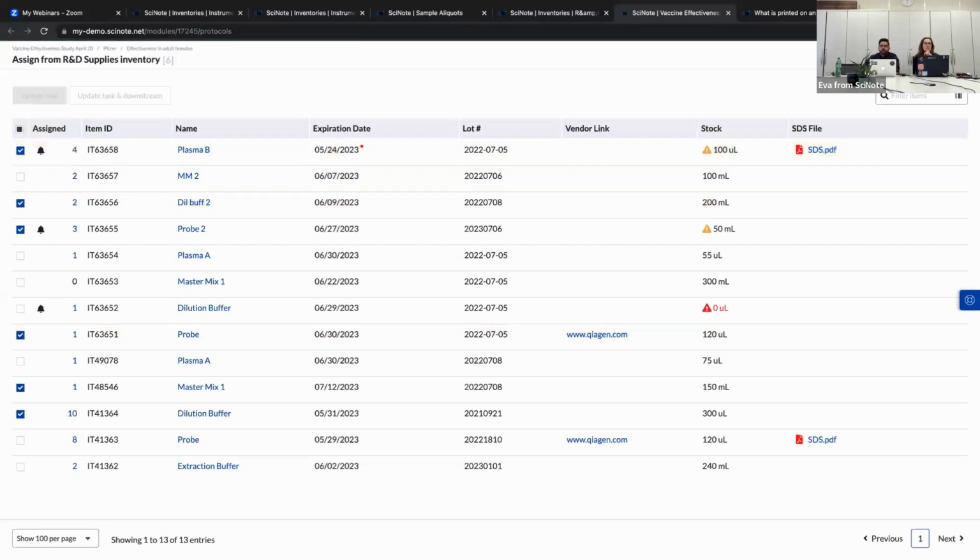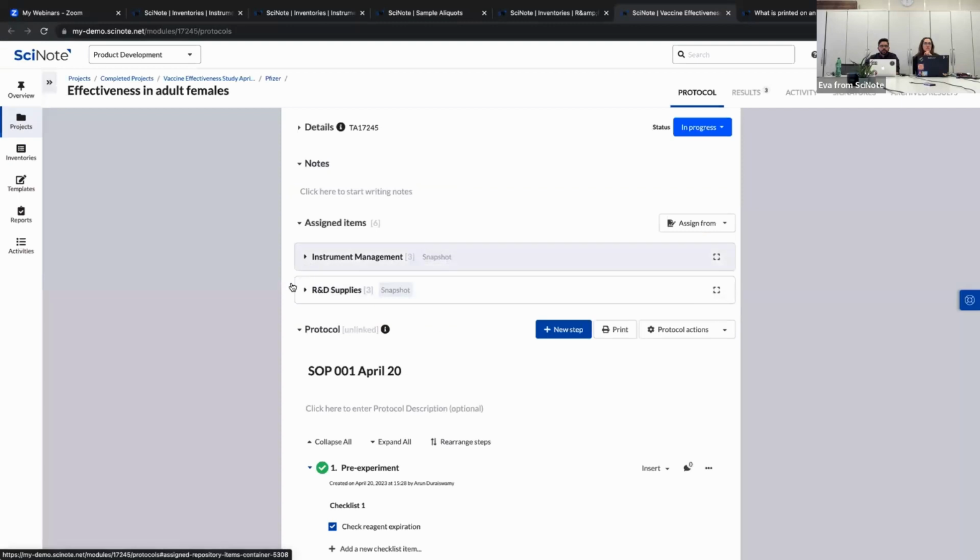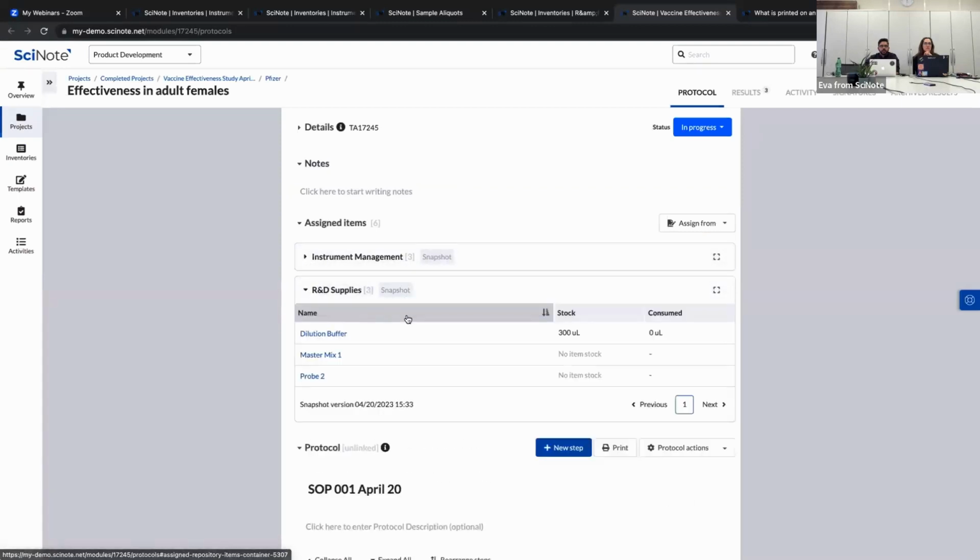So now let's jump back to our task here. Oh, sorry, let me refresh.